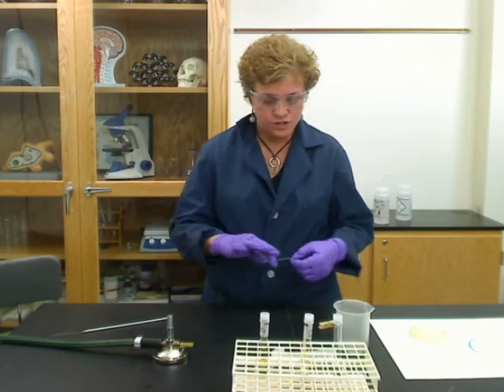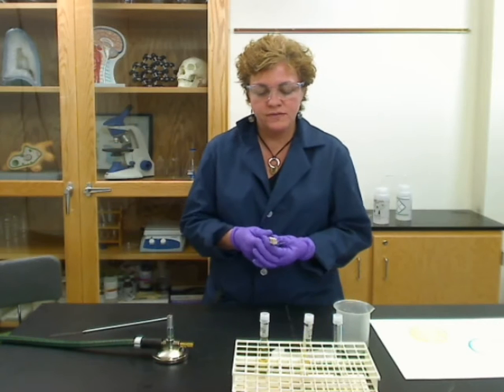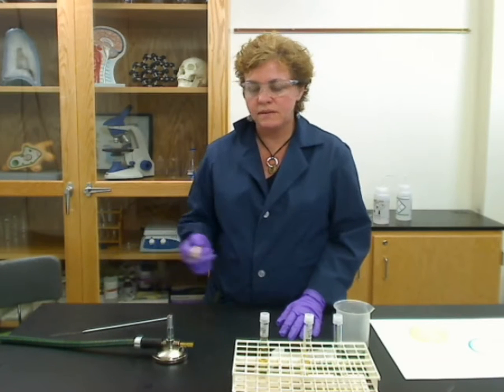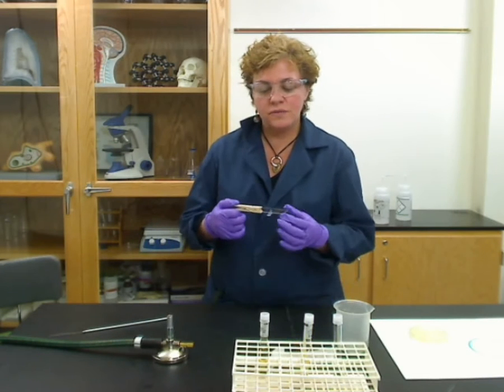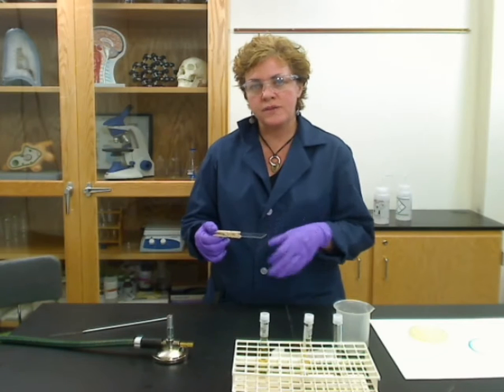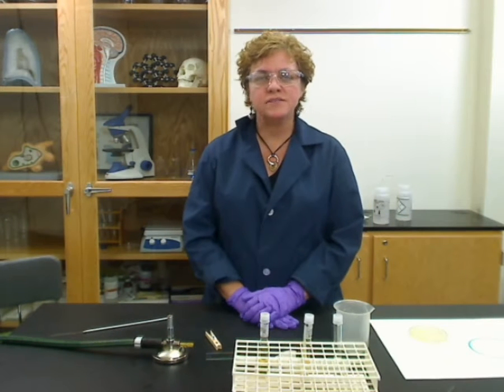Once it's dry, take a clothespin as a holder for your slide so you don't burn yourself. You're going to pass it over the flame about three to five times. This is called heat fixing. You fix the bacteria so they're stuck on that slide and won't come off when you look at them. They've also been killed. And that's making a bacterial smear.